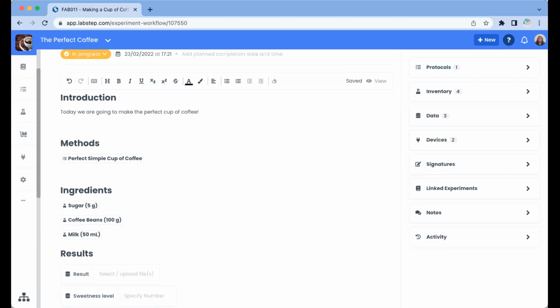Perfect. So with protocols, you get to execute and link your inventory to your research. And with experiments, they enable you to just apply your inventory to your scientific workflow, and all of this seamlessly. Okay, so you now know how to add inventory fields to your protocol, and you also know how to link the amount used of an item during an experiment to your inventory. All of these steps just contribute to consistent data collection, which we basically made easier than ever.